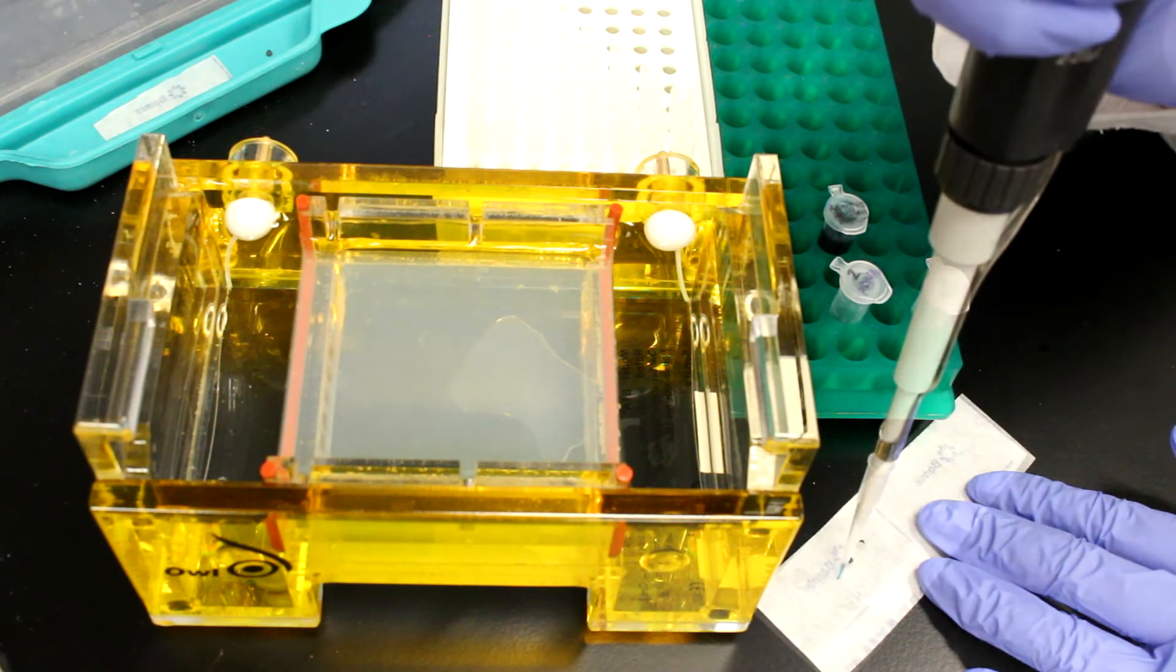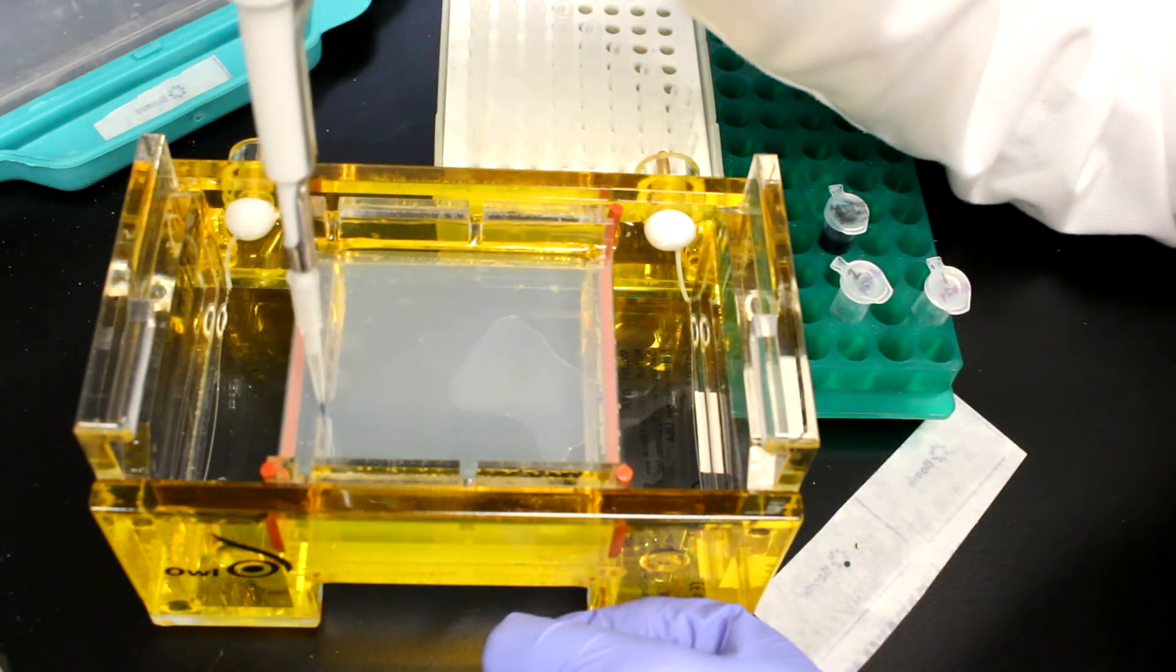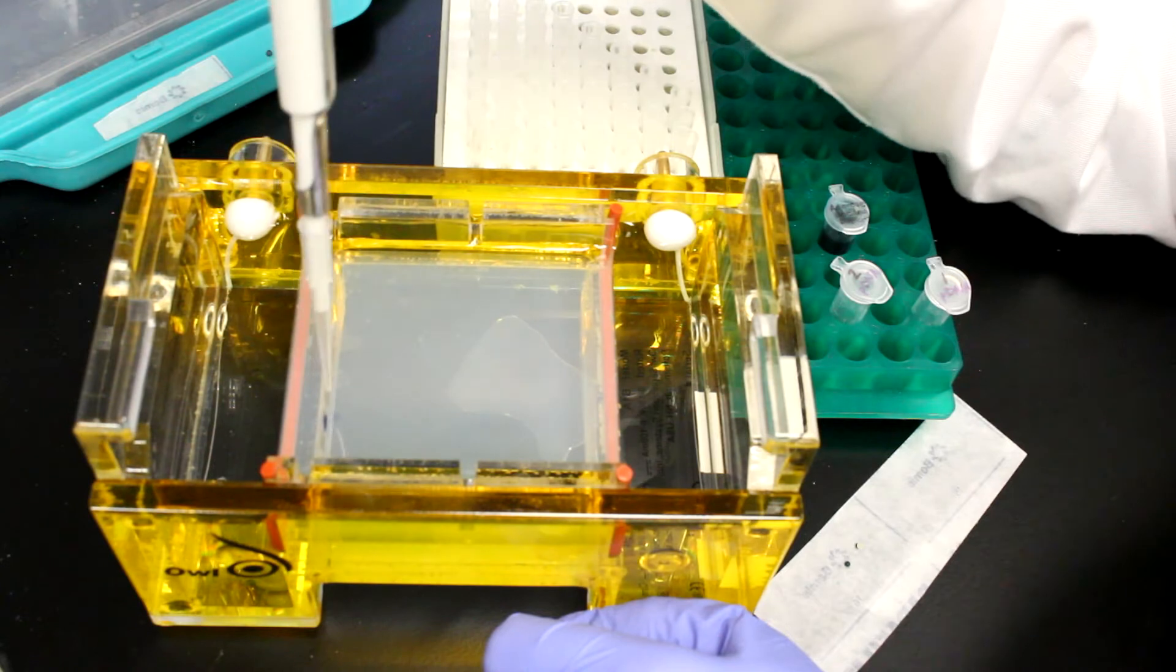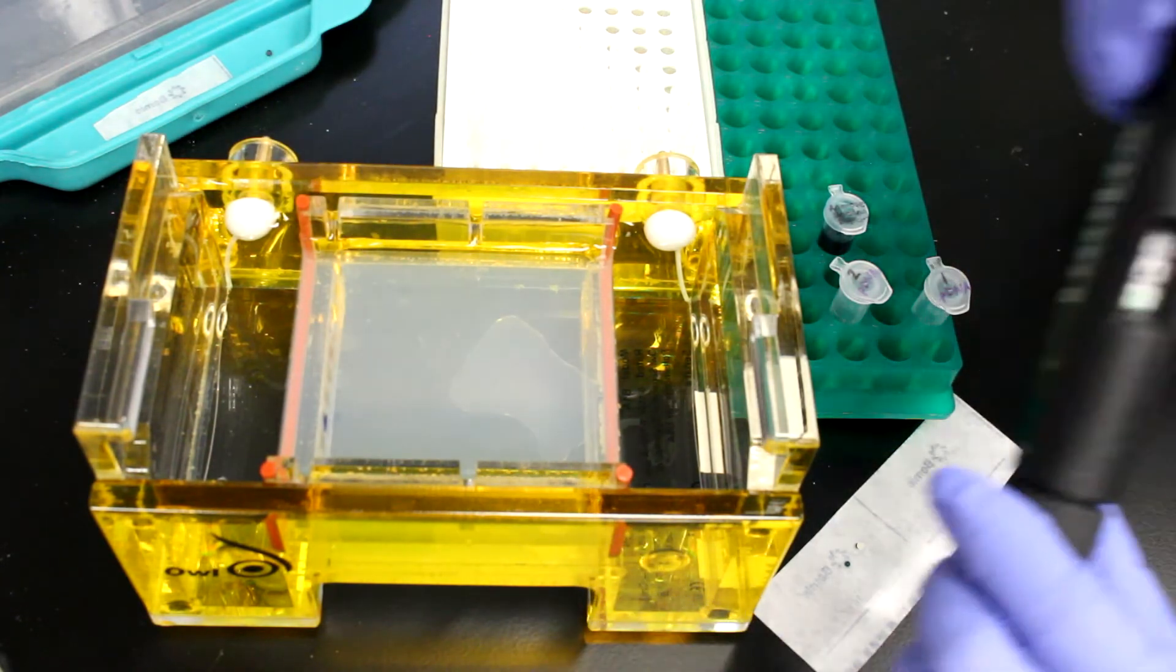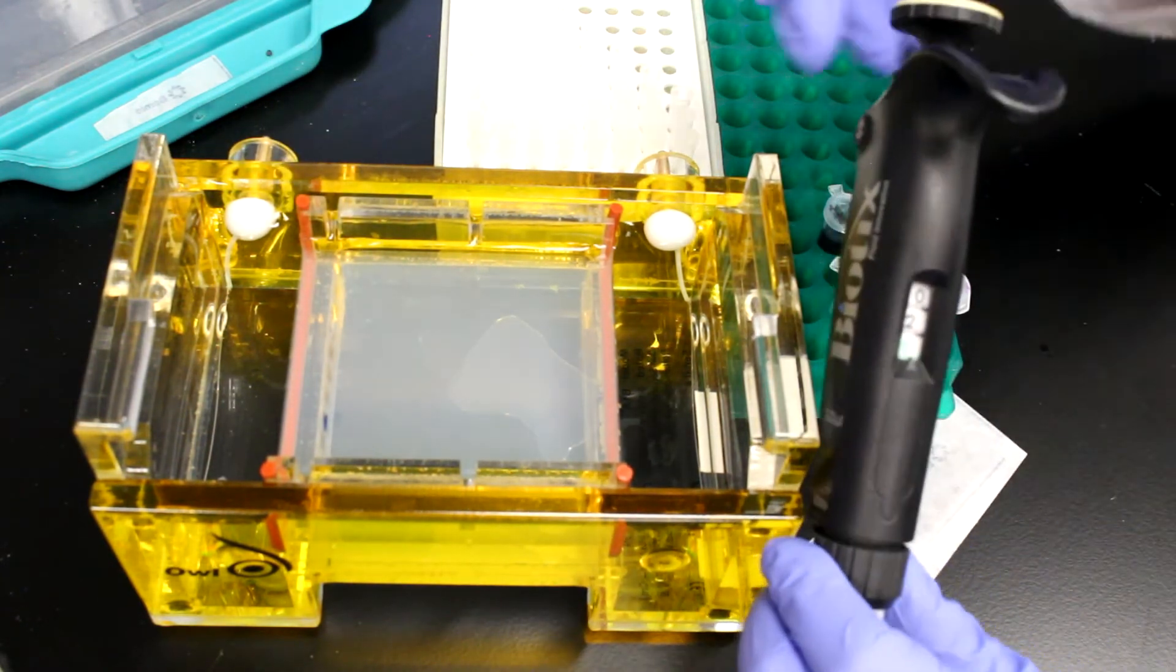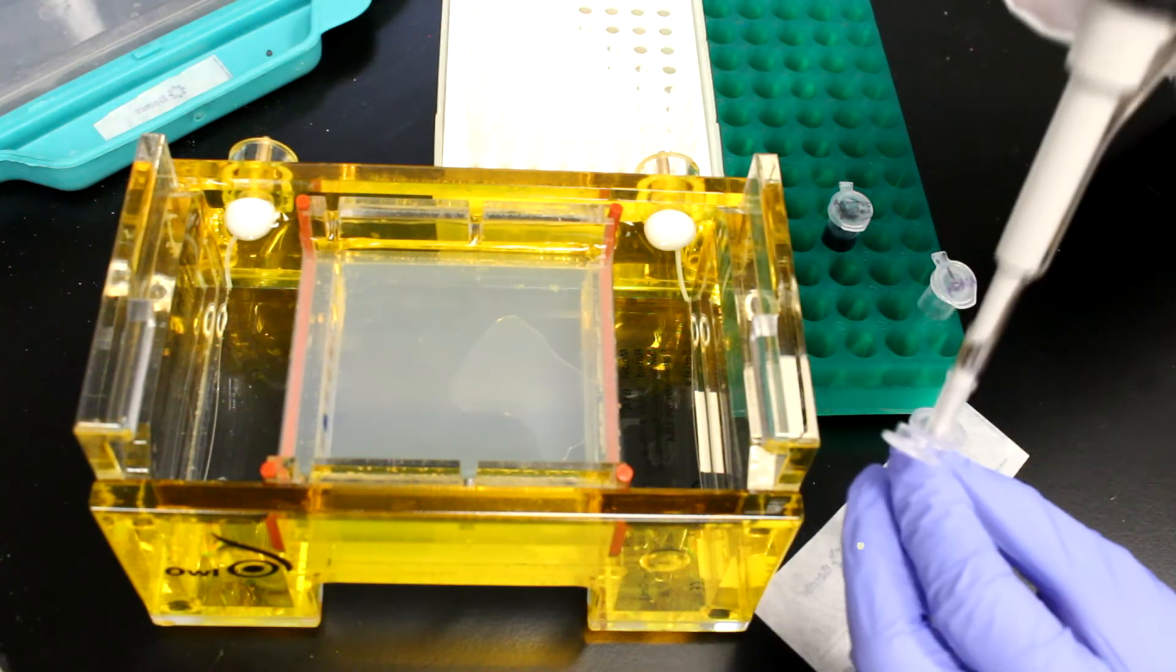The four microliter sample is then added to a well on the agarose gel. This is repeated for the next sample.